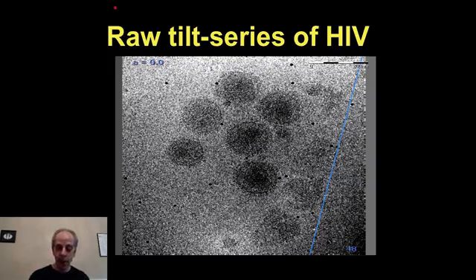Again, remember, we are interested in this kind of stuff. And actually, we are interested in these spikes. You might be able to see some of them there. But that's what we want to get, the three-dimensional shape of that. They're very, very tiny, and as we see, very, very noisy. So here's where you get the call to image processing.